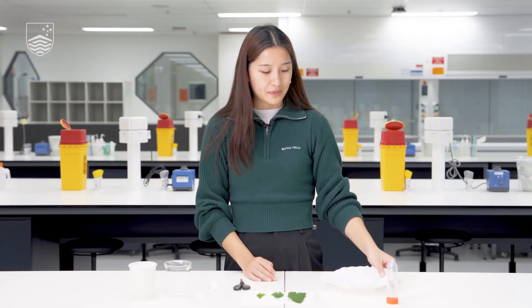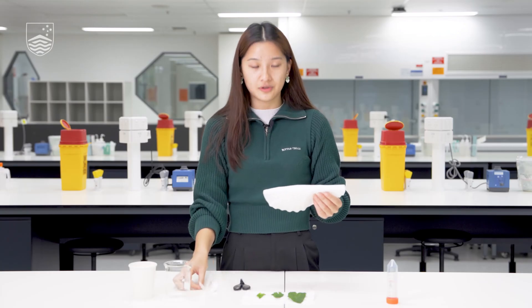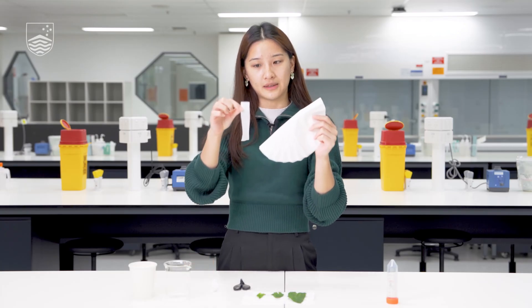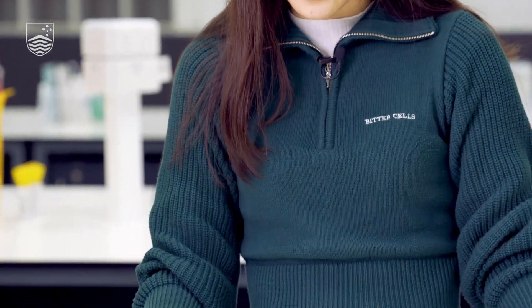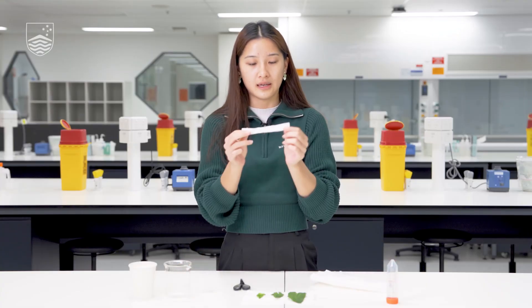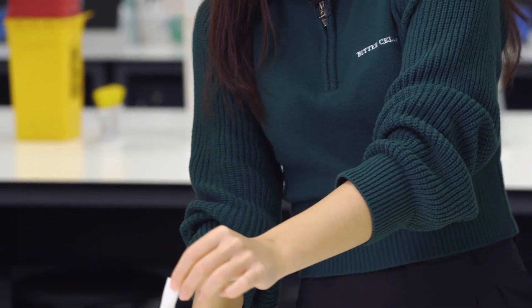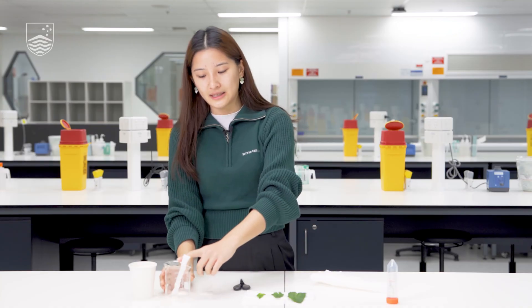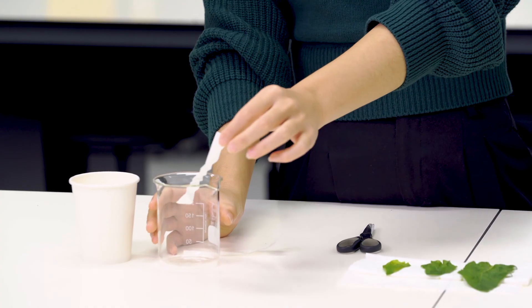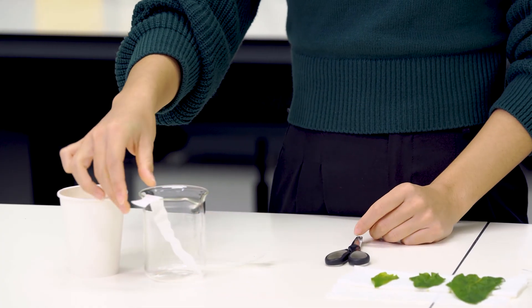The first step is to take your filter paper and cut a small rectangular strip using the scissors. Any strip that will fit into the jar you're using should be perfect. Make sure it's a little bit longer than the height of your jar so that you can fold it over to secure it later on in the experiment.